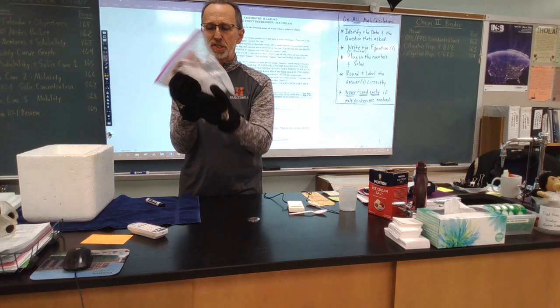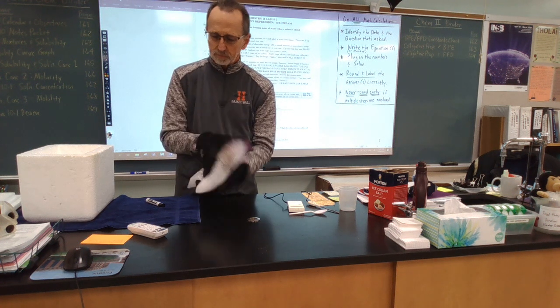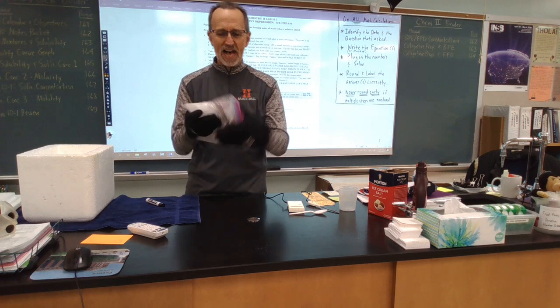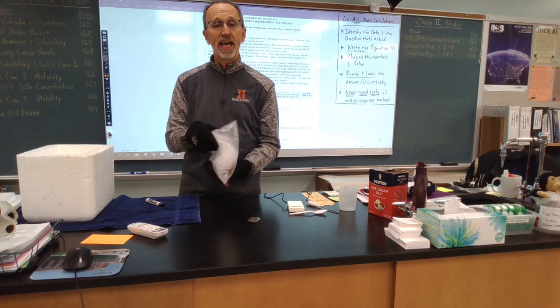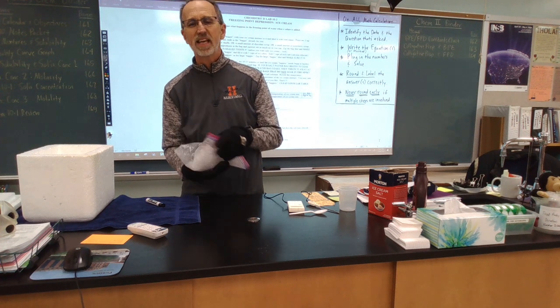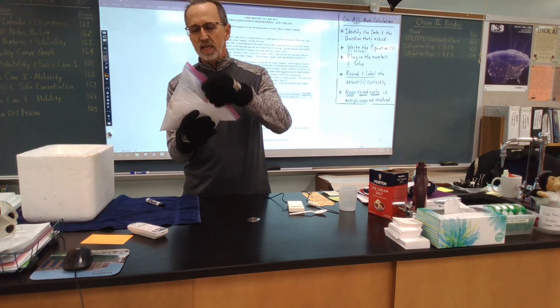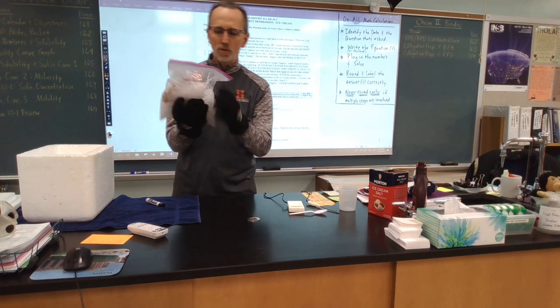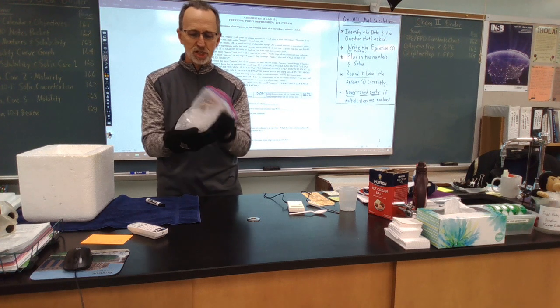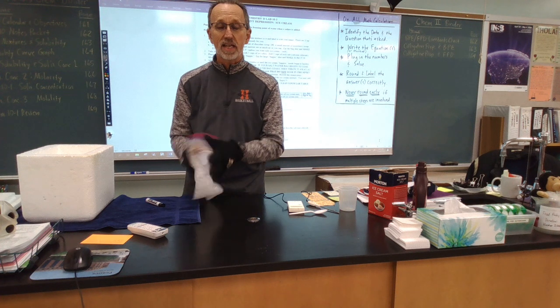Years and years ago, I had a student who thought he'd be the tough guy and try and do this with his bare hands. And I said, don't even think about it. You could get frostbite. And I was serious. Well, as I had my back turned and was dealing with some other students' questions, I turn around. He's got the bag in his bare hands.